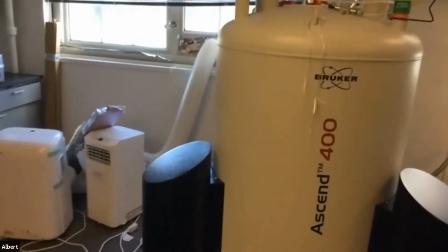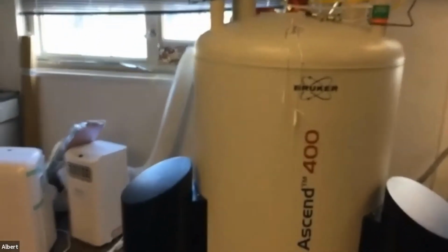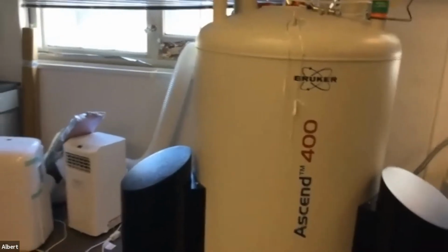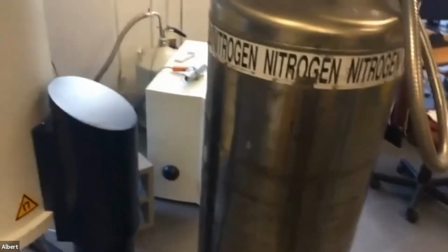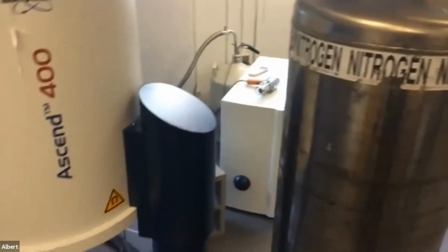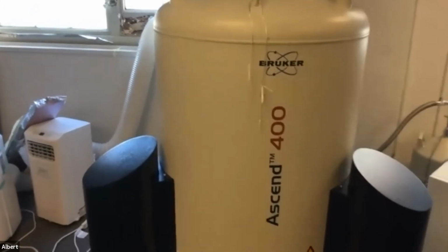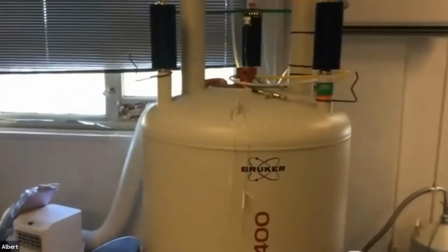And it has to stay at a certain temperature. It's got to stay cold, otherwise the magnet will quench and the instrument will be useless. So once a week, we have to take a dewar of liquid nitrogen and fill this thing up once a week. And then liquid helium, we fill it up once a year with liquid helium. All right, so this is a really cool instrument.